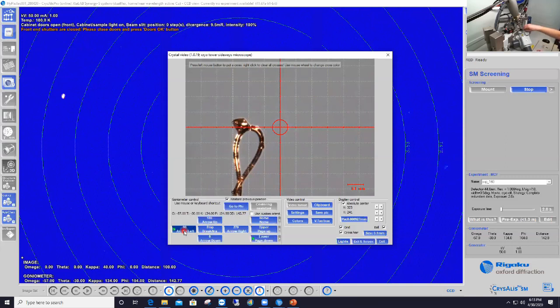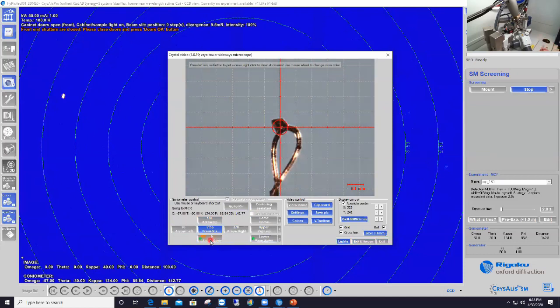So now I can set my tool here again and center my crystal in what we will call, let's call this direction Y, the first one being X. Okay. So once you have centered along Y, this is good practice to come back and center or check your centering along X to see whether you need to adjust things a little bit here, which oftentimes you do.